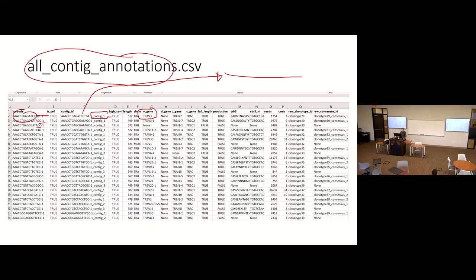So this cell has a T cell receptor alpha chain V3, so there's a V and there's no D. What's the J? It's receptor AJ27. Then there are CDR regions as well. So this is the full sequence we get from the TCR region for this particular cell.